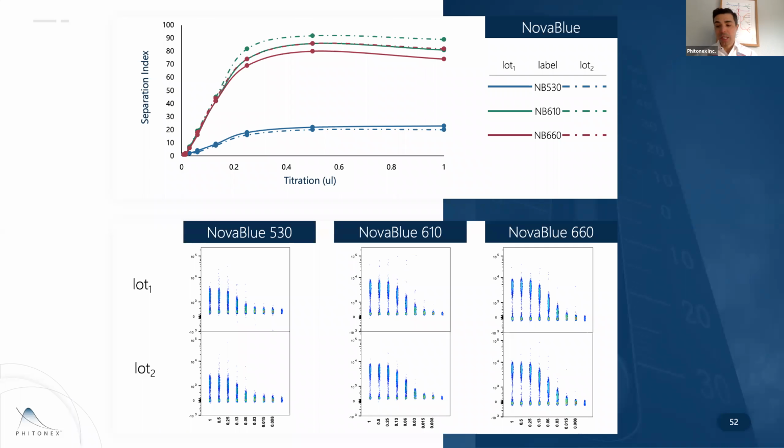So we've actually, maybe somewhat tongue in cheek, but also kind of like, wait, why didn't we do this before? We came up with a checklist of things to ask your vendor. Have you looked for room temperature stability? What's the stability of this in fixative? Can you show me your lot to lot data for your fluorophores? Can you show me your lot to lot data for your antibodies? Because honestly, personally, as we run these experiments, that shouldn't be on us. And so that's the lens we're applying.